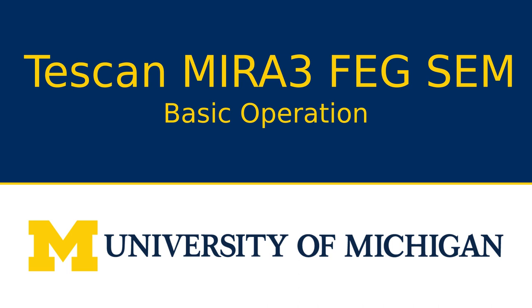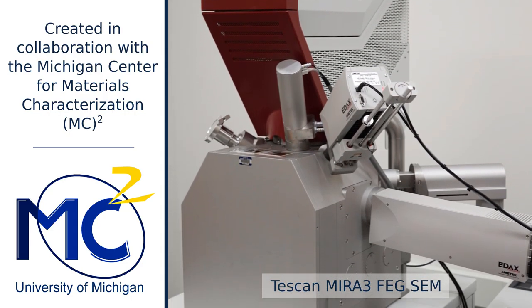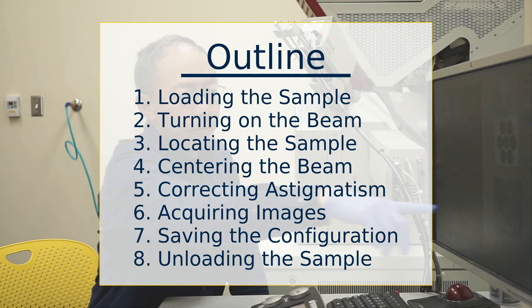This video covers basic operation of the Tescan Mira3 FEG SEM and is created in collaboration with the Michigan Center for Materials Characterization, MC squared. Basic operation of this instrument will be covered in 8 steps: loading the sample, turning on the beam, locating the sample, centering the beam, correcting astigmatism, acquiring images, saving the configuration, and unloading the sample.